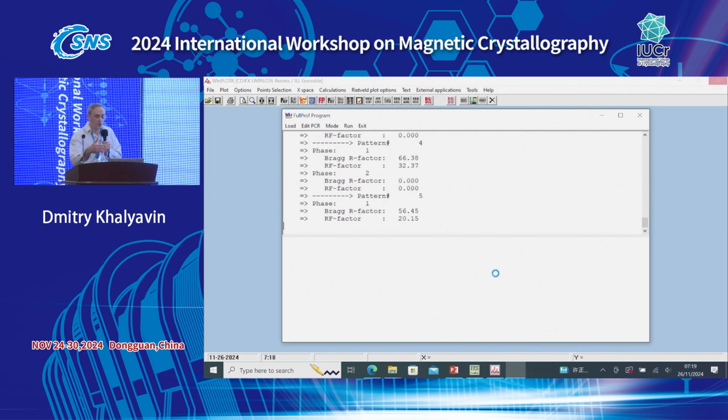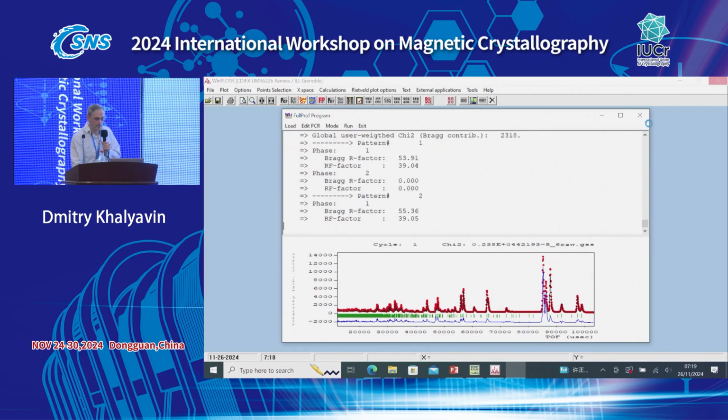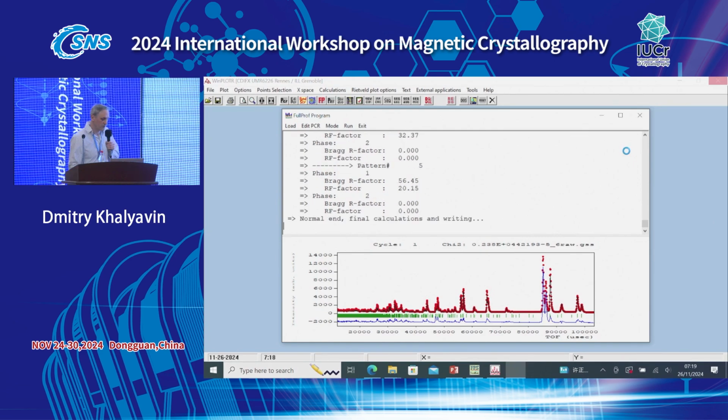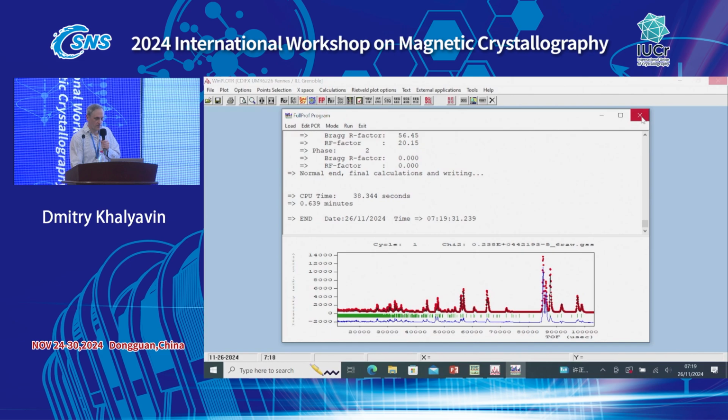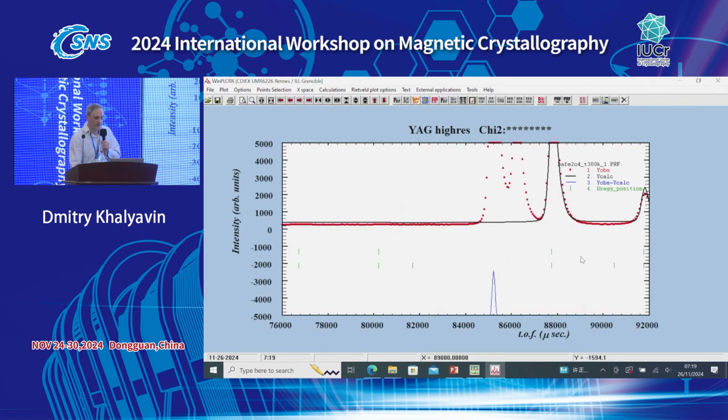When you know how it works and what you are doing. Yeah, it's quite slow because it generates a lot of reflections. Look at this bit of the pattern, how dense, it's many reflections. So, again, didn't work. We missed.